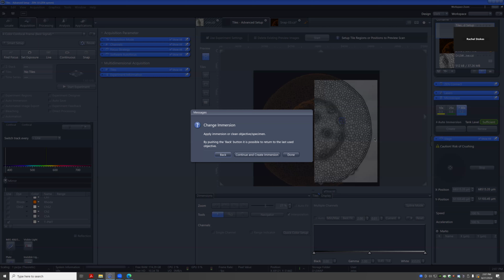You can see this little tube that's hanging inside that pumps the water out into the pipette that sits on the stage over there. But what's important to keep in mind is that it uses the cover glass and the distance to the objective to push water in between. So it does need things to be close to each other to get the water into the place where it needs to be. So this is always good to keep track of what it's doing.